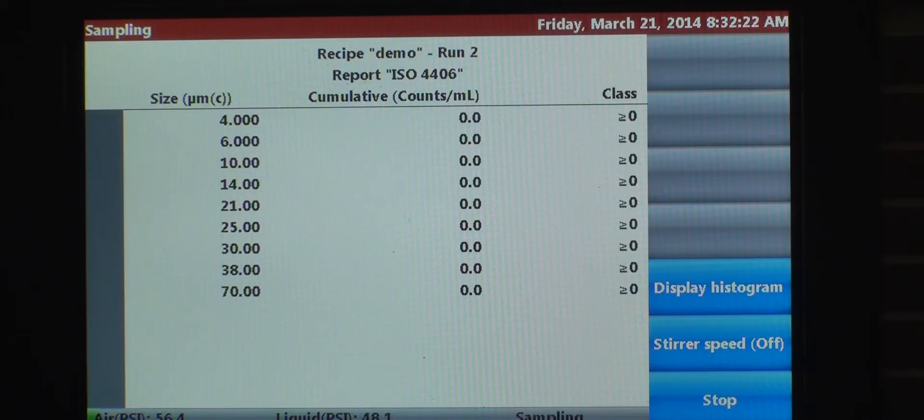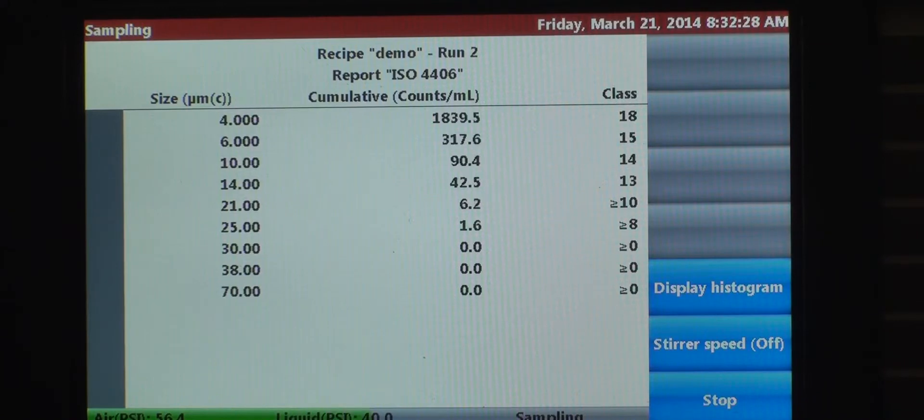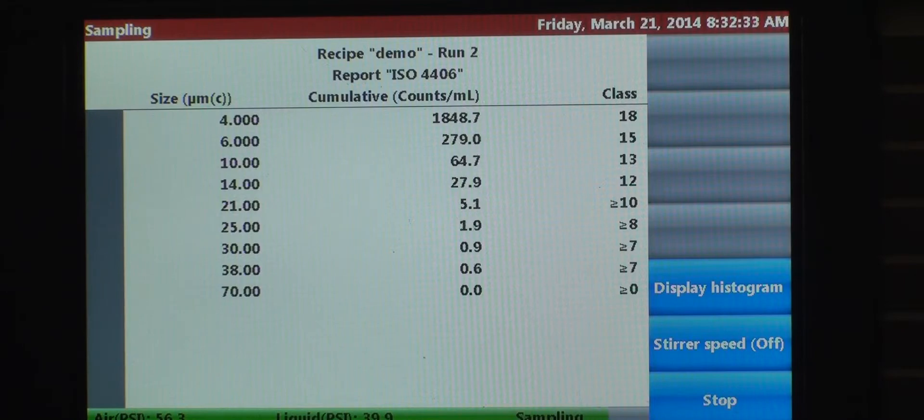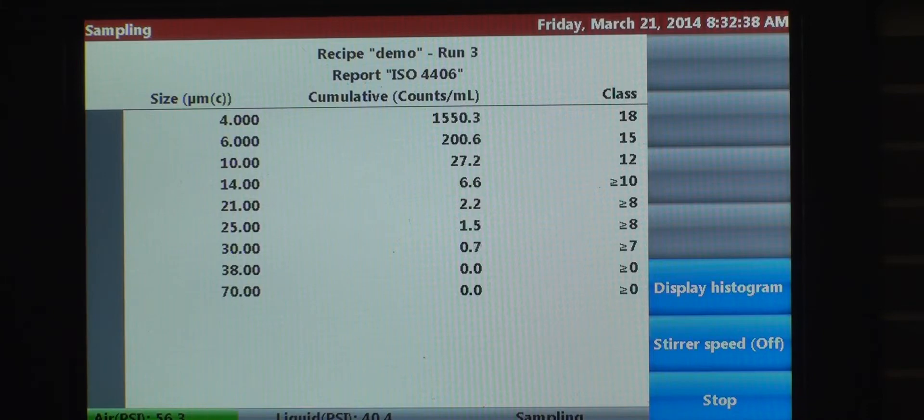First run is complete. We're sampling again for run number two. And this is our final run.